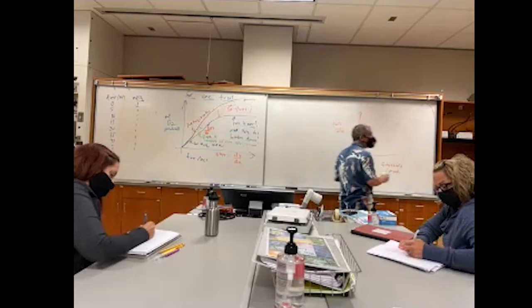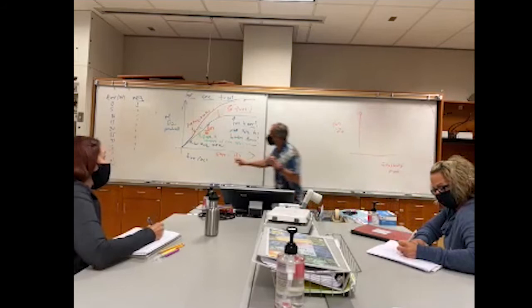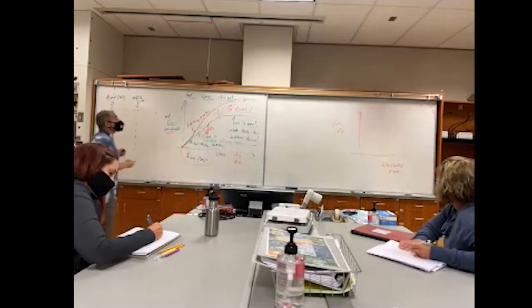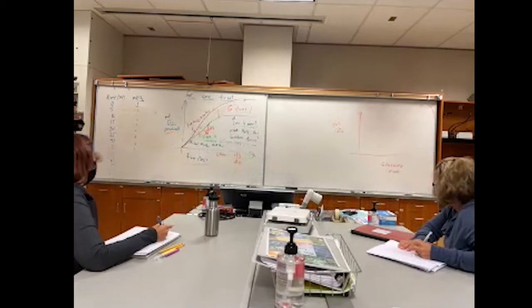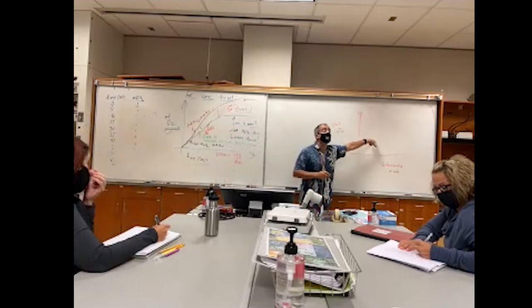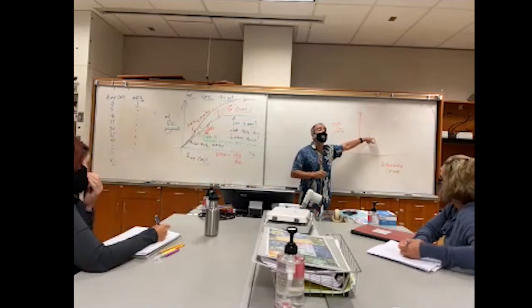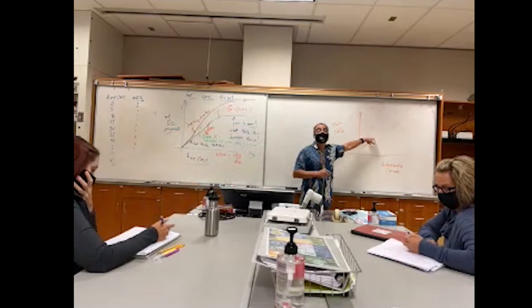And that's what we really are looking for in our objective. Each of these graphs of time versus oxygen are going to be necessary to get down, but it's only in service of getting these reaction rates, which we can then put on this second graph, which is the one that's actually going to help us answer our question and our objective. So there's going to be 2 steps.